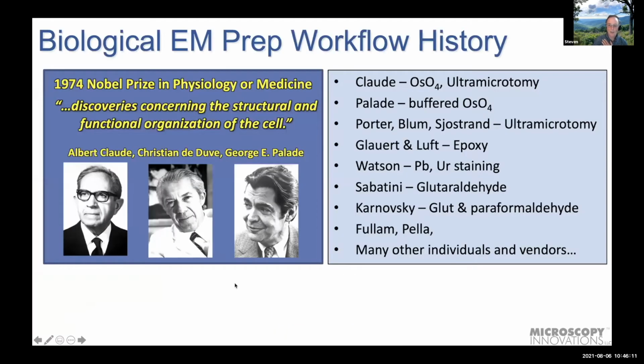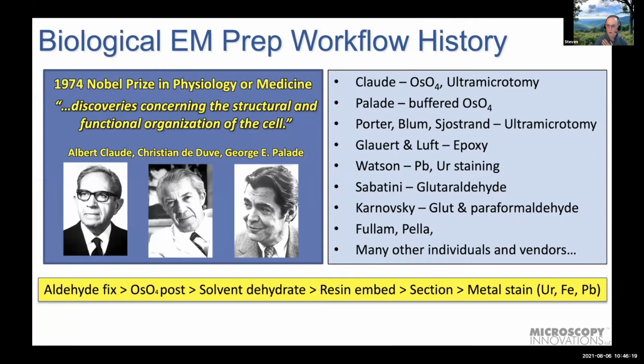Biological EM began due to these and many other EM pioneers. So we're beginning at the beginning here. They created the chemical preparation workflow that we use today, aldehyde fix, osmium post fix, something that I think all of us here know quite well. Let me get the laser pointer up. Okay. So this is where it all began.